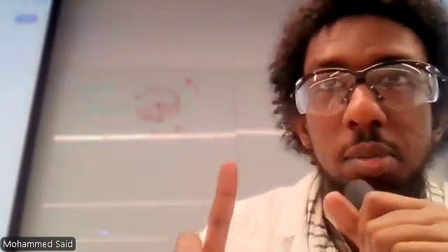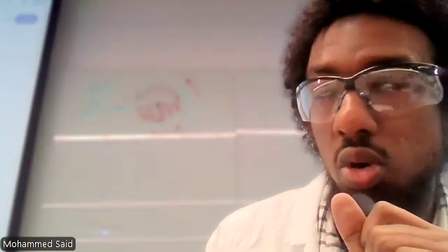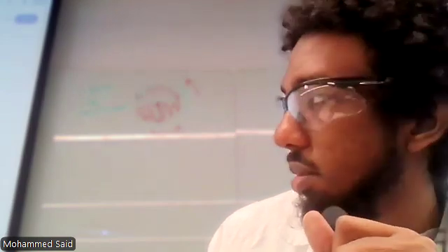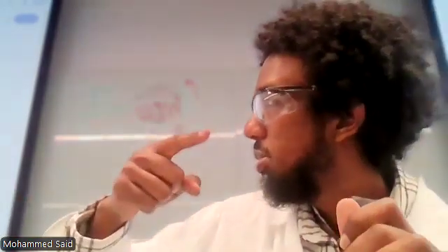There is a question about using pipettes. How many of you are struggling to use a pipette so I can help both of you in tandem? Okay, let me just help this group and I'll come to you next. When your group is done for conjugation, let me know in about 3-ish minutes.